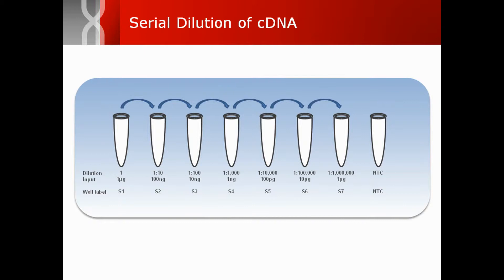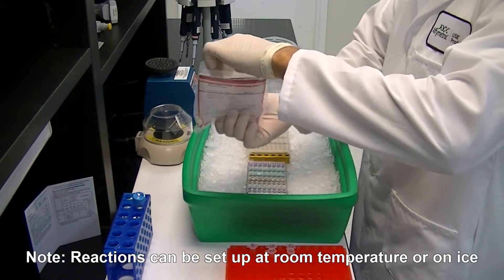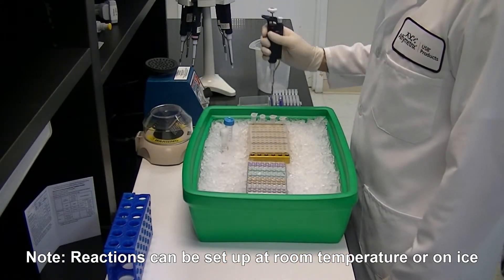One of our scientists demonstrates here the simple assay workflow for evaluating VariQuest qPCR performance. Start by thawing the master mix and other frozen reagents at room temperature. Once reagents are mixed and spun to collect contents, place them on ice.